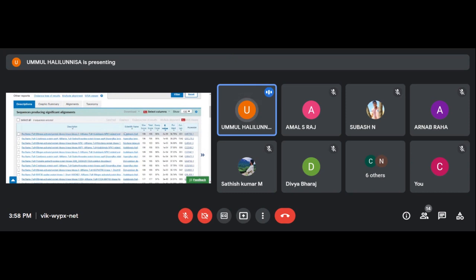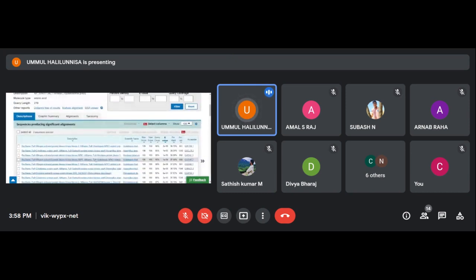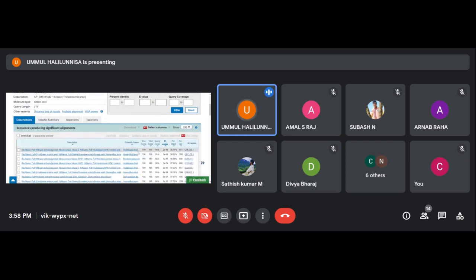That is Arabidopsis thaliana. This is from Trypanosoma, and the one matching most highly is Arabidopsis, with 98% query coverage, an E value not up to the 0 level, and a percentage identity of 36.79%. So from 100%, it is only having an identity of 36%.